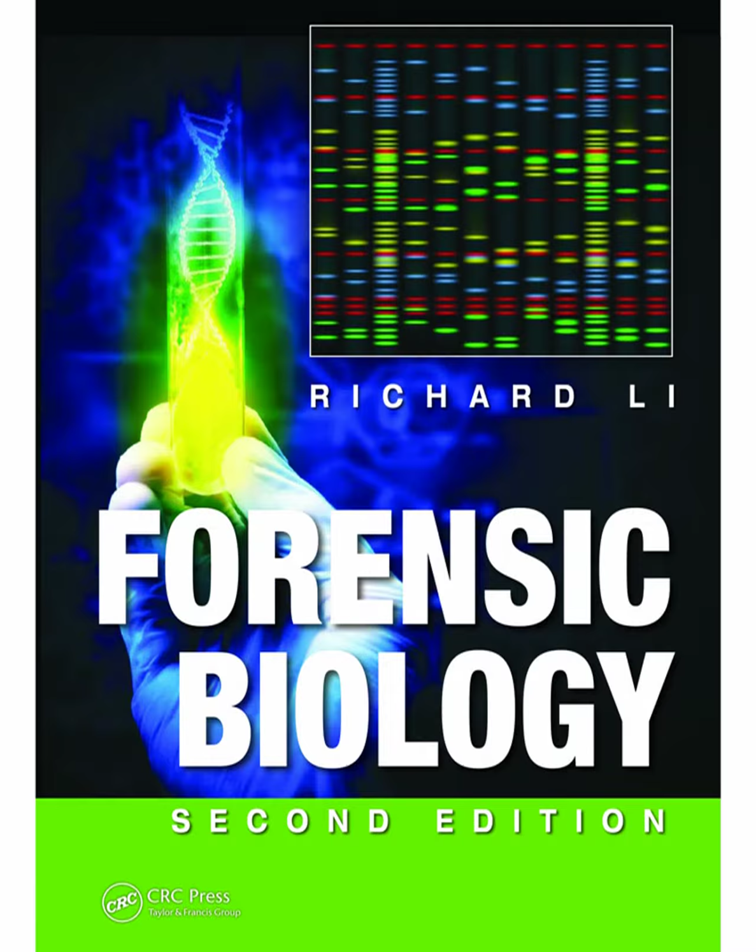It's a structured workflow. Start simple. Visual examination. Does it look like blood or semen or whatever? But looks can be deceiving. So the first real test is usually a presumptive assay. Think of these as quick and dirty screens. They're designed to be super sensitive, fast, and easy to use, often right there at the scene. Sensitive meaning they can detect really tiny amounts.